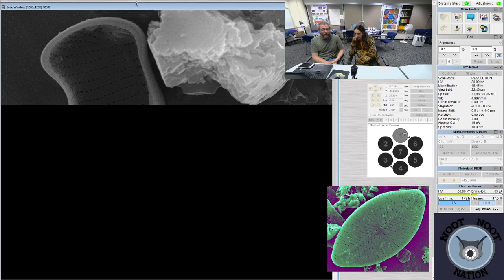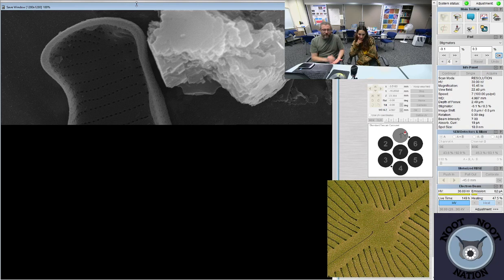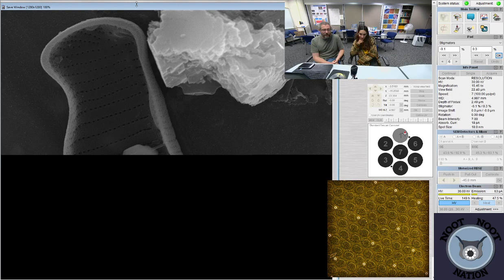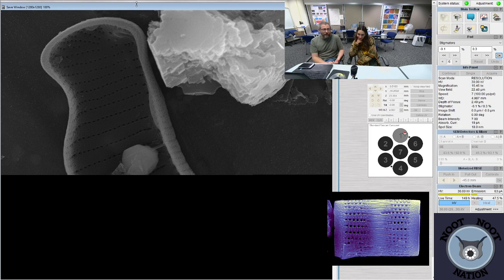Usually when you go to a lab and they're charging you an hourly rate, what they're charging you for is not the cost of the instrument, but replacement parts and maintenance, and potentially they might want to save up their money to buy another SEM to replace the one they have. So that's their cost usually. If you take care of an instrument like this, it'll probably last 20 years, and we've been taking pretty good care of ours. I had a couple of years of service maintenance included in the grant that I wrote for the SEM, and we've been able to cover the cost of it using that for now.